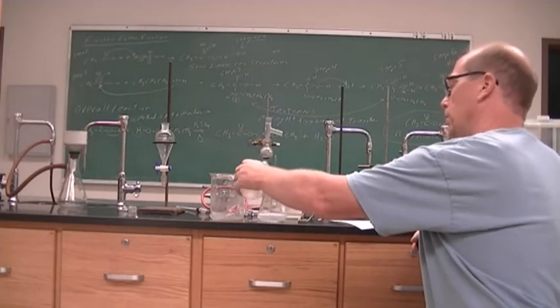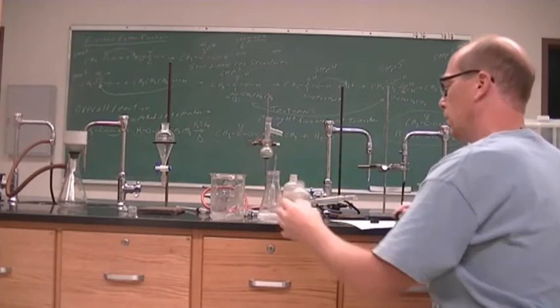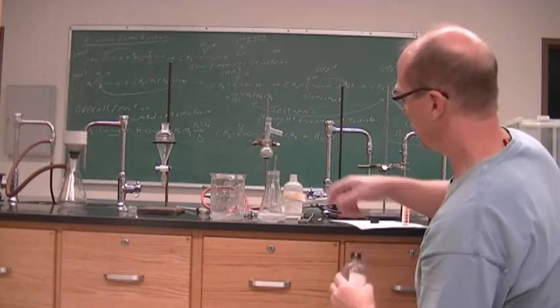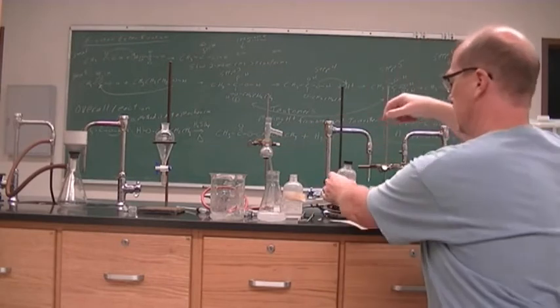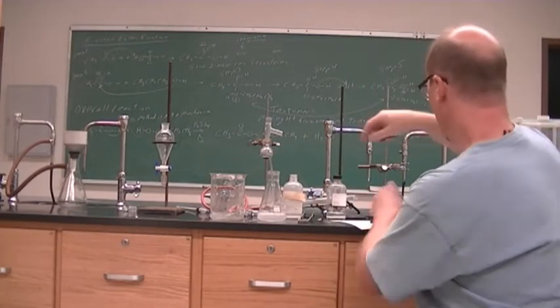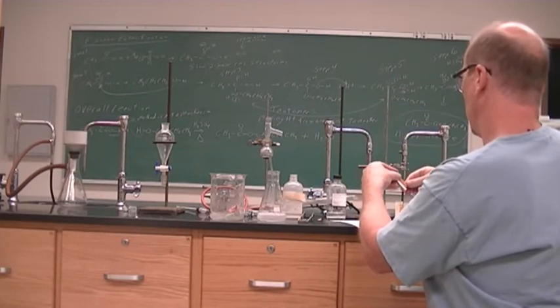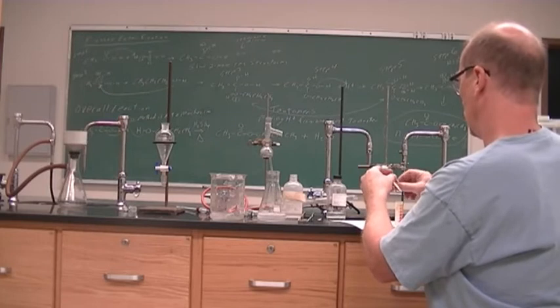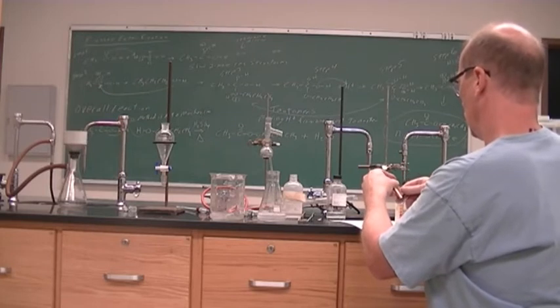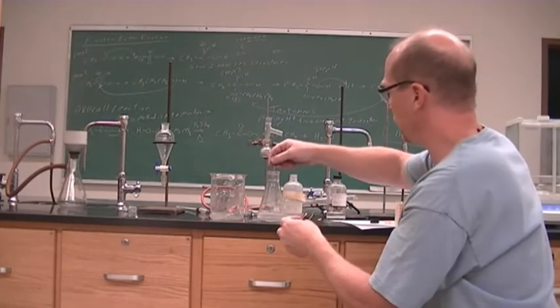Bottle of sodium carbonate. This one might be a little more concentrated. All right, well, we'll test. I thought it would be pink by now. Litmus paper.